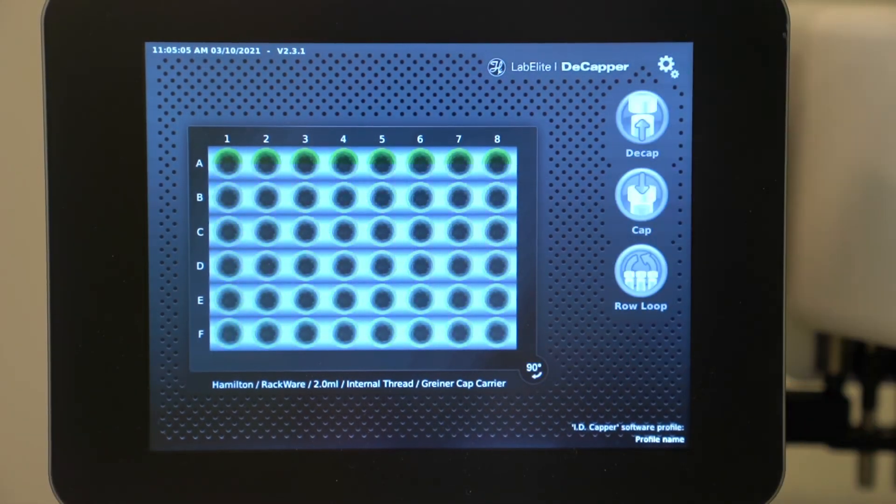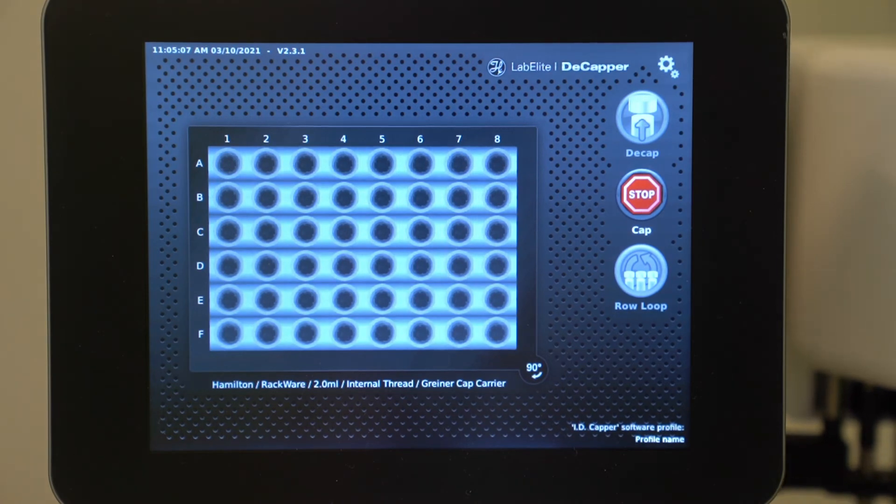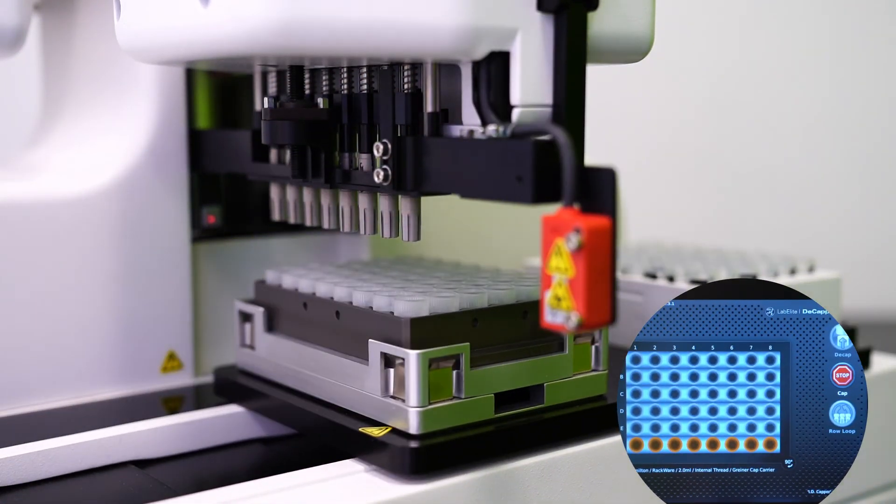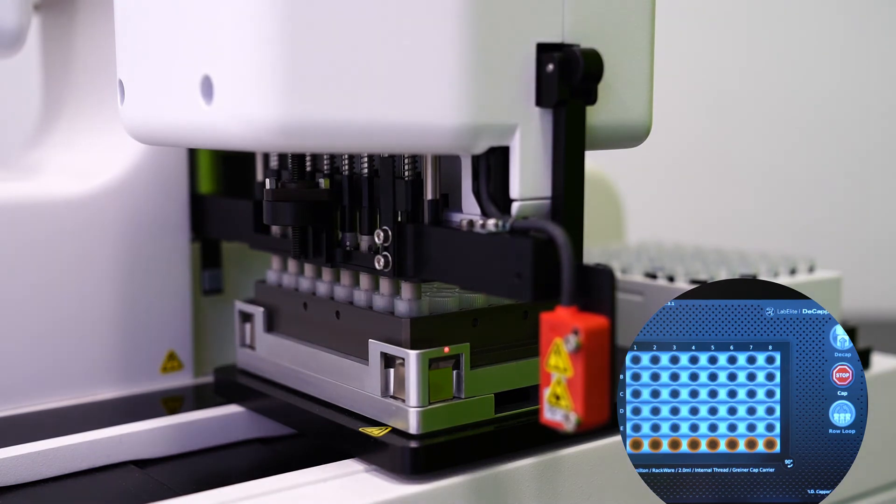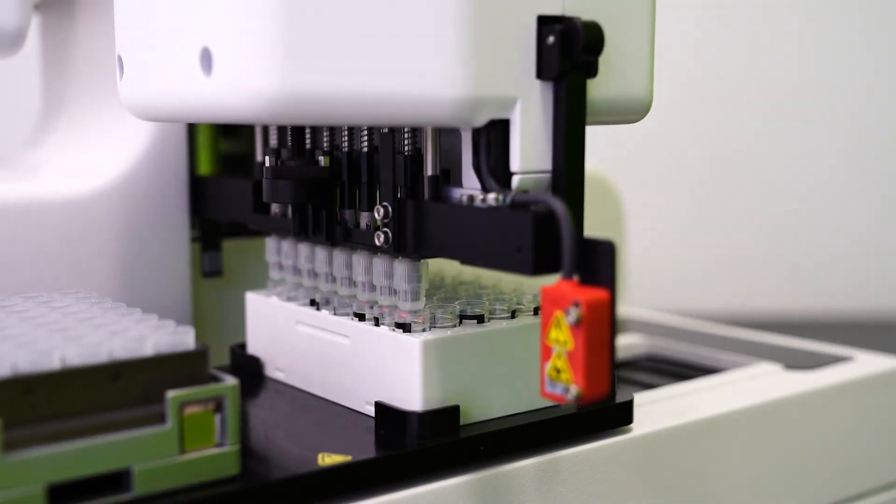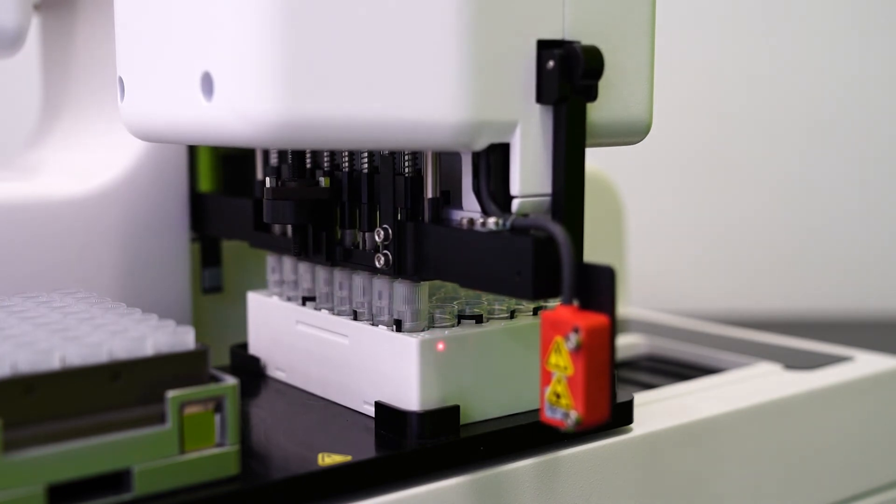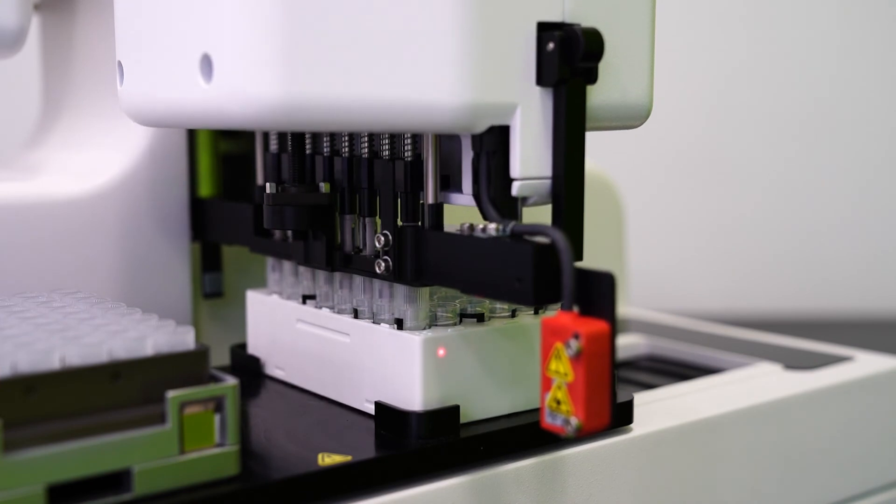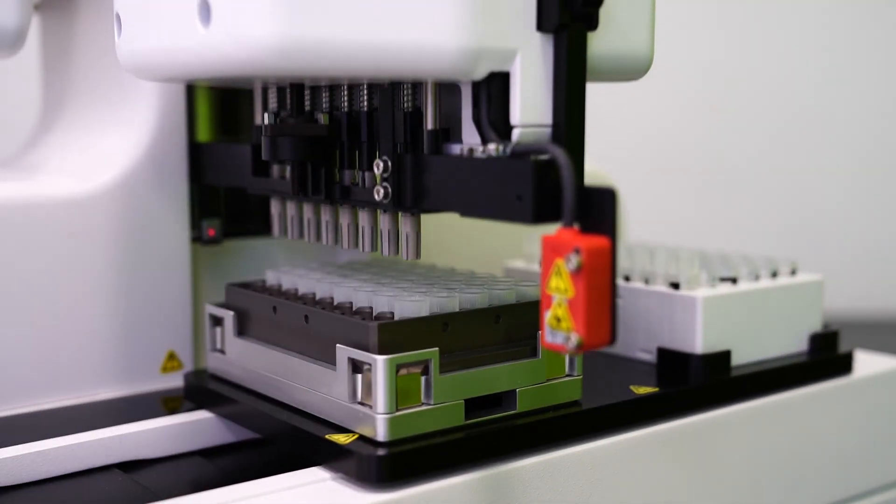Now we're going to hit cap. While this is running, let's talk briefly about secure mode. Secure mode is another useful security feature to aid in error prevention. As you can see, the system caps the tubes clockwise then rotates one quarter turn counterclockwise before re-securing the cap. It does this to ensure proper torque for all caps.